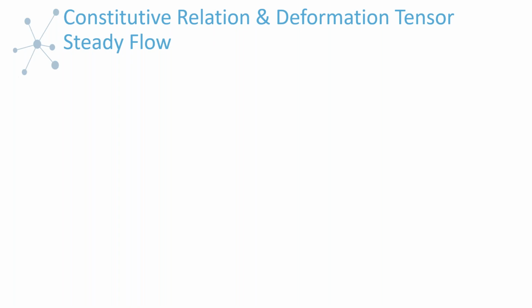We're going to start with this in the tensor form, because what I want to show you ultimately, just as a sneak peek of what's coming up, is that when you choose your geometries properly, everything simplifies dramatically. And that's why it's so important to design these experiments properly, or design the instrumentation properly.